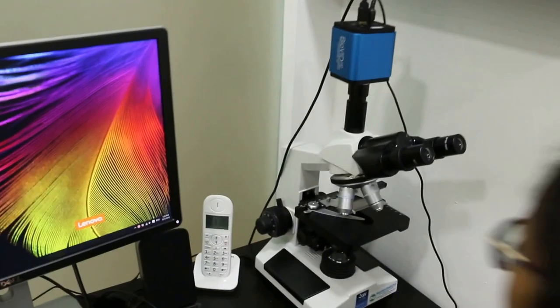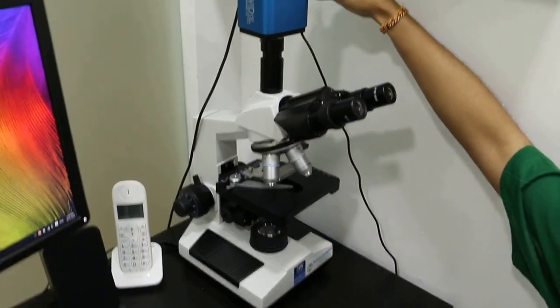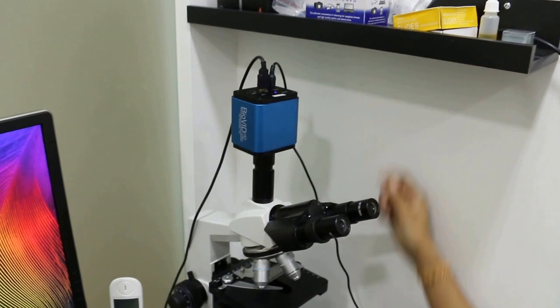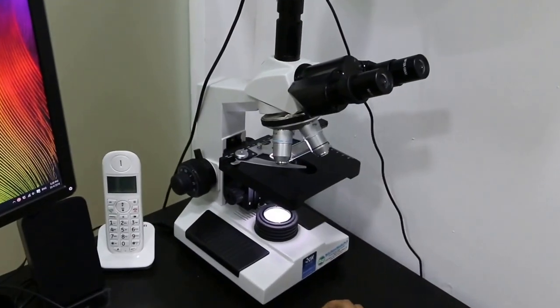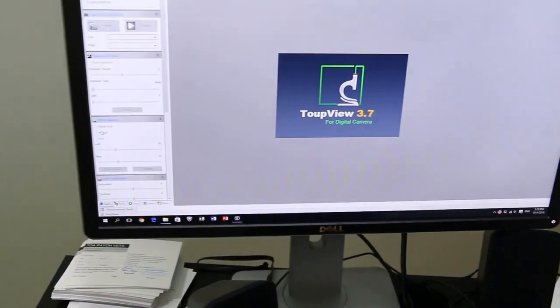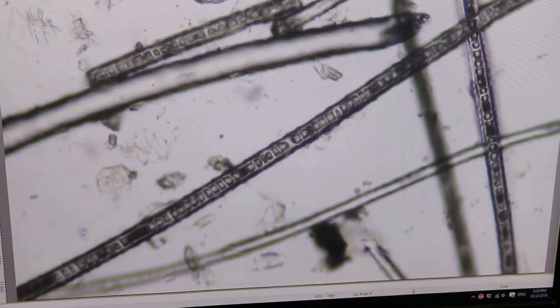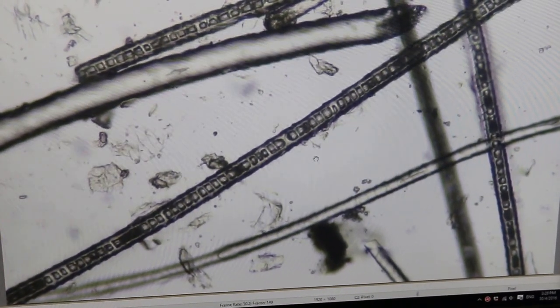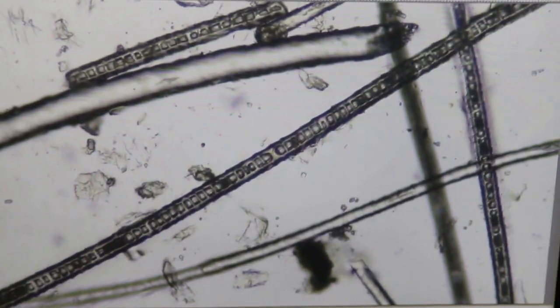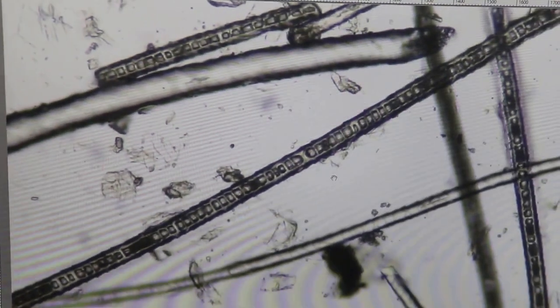I will show my assistant. I have mounted the slide on the microscope. Now she switched it on. Now in Queen's Veterinary Surgery we do have the software which we use to show to the customer what you see on the microscope. Instead of having the customer peer onto the microscope, we have this monitor to show.